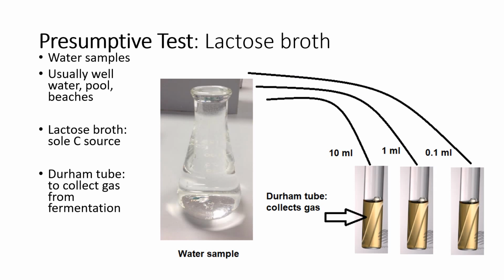Okay, so it is a 3-part test. The first one is known as the presumptive test. And the presumptive test, see what that means? Presumptive. I already assume, I presume it's in here. Guys, so let's just assume that this water sample is contaminated.